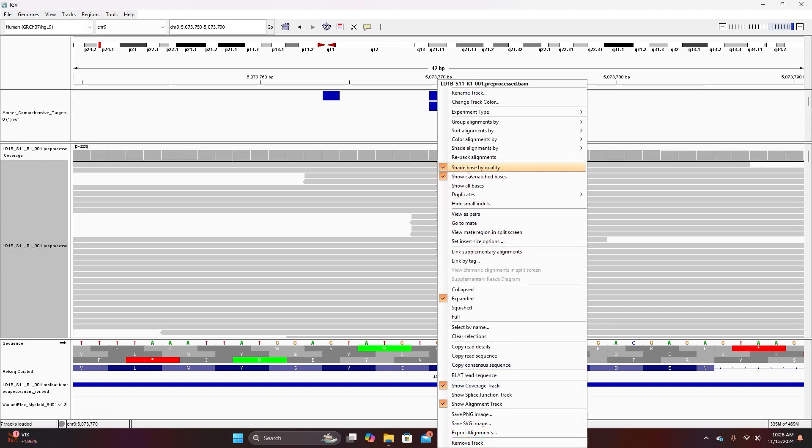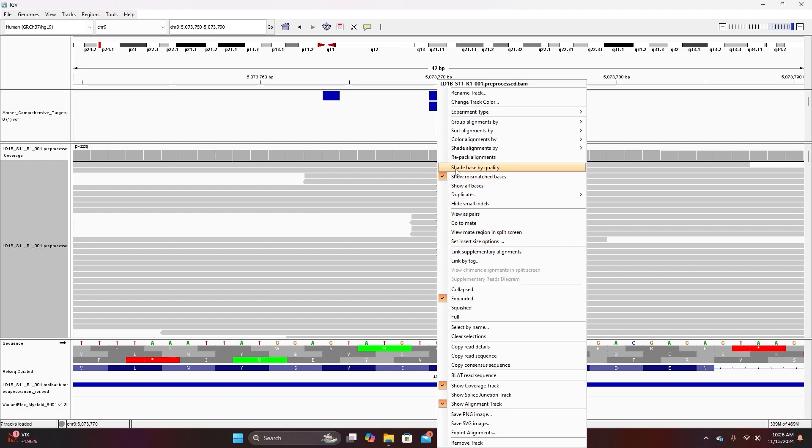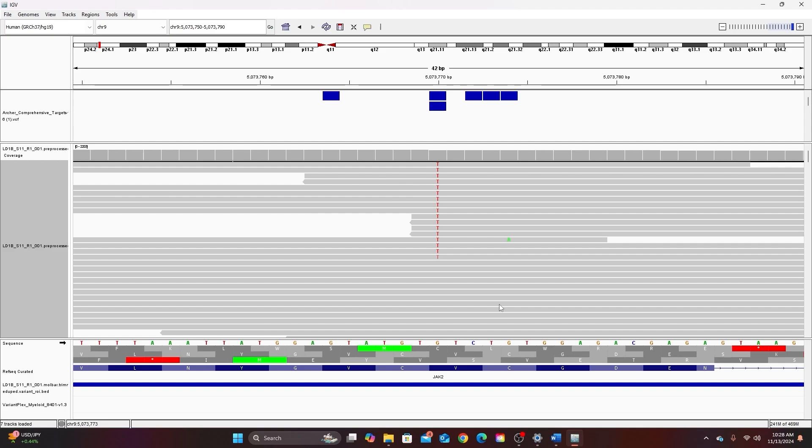I can also shade bases by quality score and this just means that when that is selected bases that are of higher quality will be darker than those with lower quality. So this T here is fainter than the T's above it and that means that its quality score is lower. So if you were to have a variant composed entirely of very faintly colored nucleotides that might suggest that you're not very confident in that variant being real.